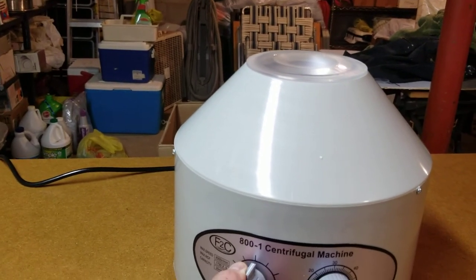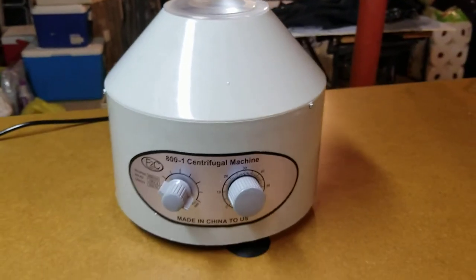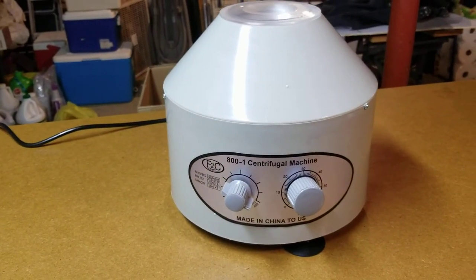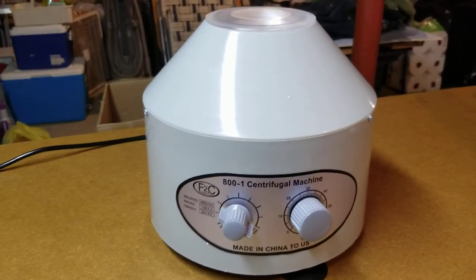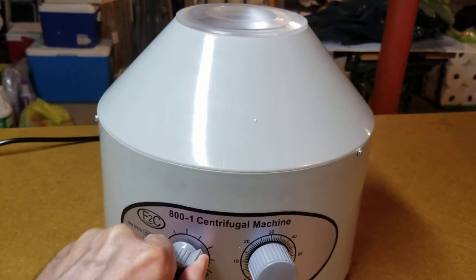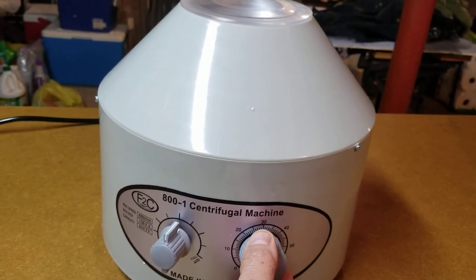Why don't we turn it all the way up. It's louder on the highest setting, but it's not super loud. I'm going to turn it back down and turn it off.